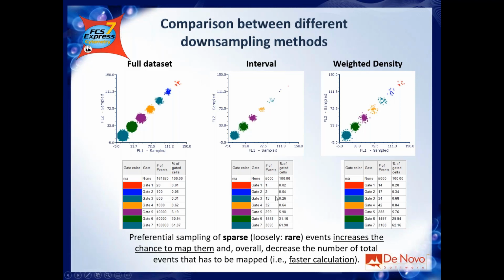This means that you will probably not be able to cluster those cells as actual clusters, as actual populations, because you didn't sample enough. It means that the algorithm will probably not be able to understand that those are 2 populations, or even that those 3, the last rarest 3, are 3 different populations. They will probably be considered as a unique population.